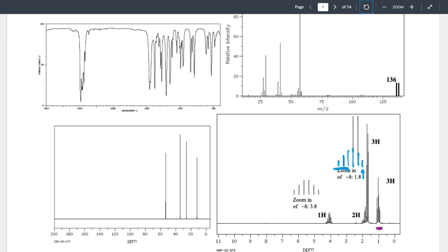How about the CH? I know my CH is next to a CH2 and next to a CH3. Do I have a CH up here? I do. It's next to a CH2, and I don't know what it's next to. If these two were duplicates, this would need to be my CH3, but if that's the case, these two need to be duplicates. Well, that CH2 is next to a CH, that CH2 is next to a CH. What does that mean? These are duplicates, these are duplicates. I can take that information.